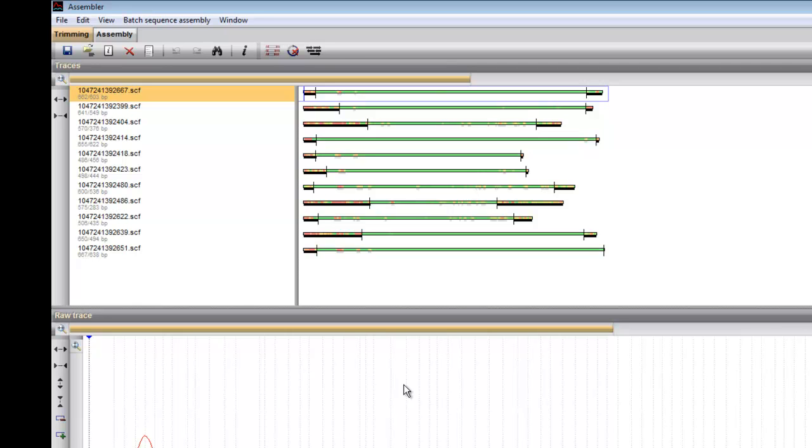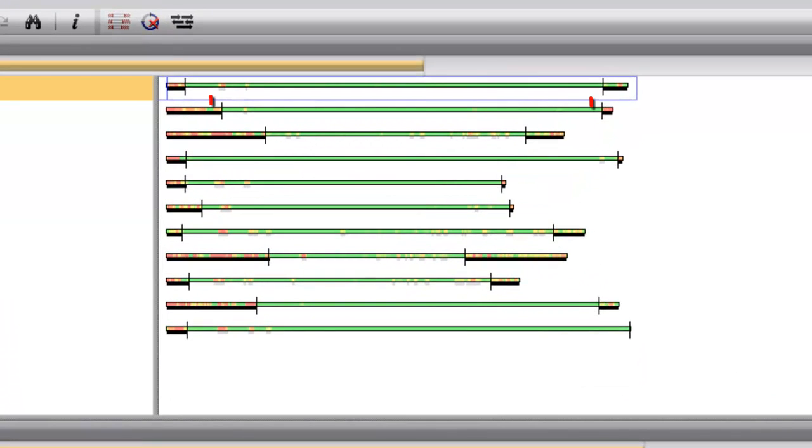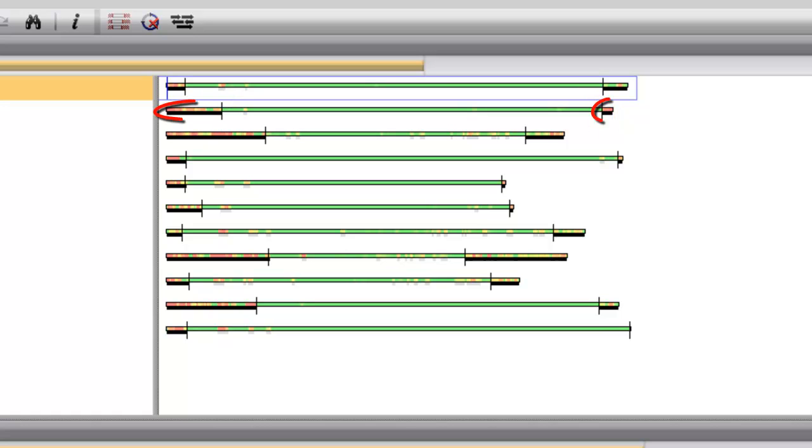Green stands for high quality, ranging over yellow and orange, towards red, which stands for low quality. The beginning and end of each partial sequence, which usually are of lesser quality, were automatically trimmed off. The trimming sides are marked by black pipes and the trimmed off regions are underlined by a black bar.